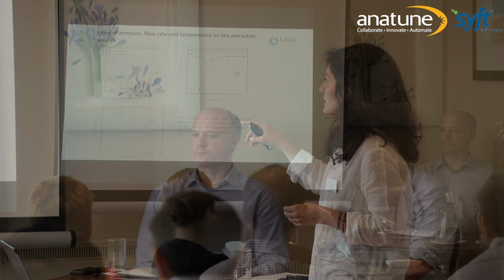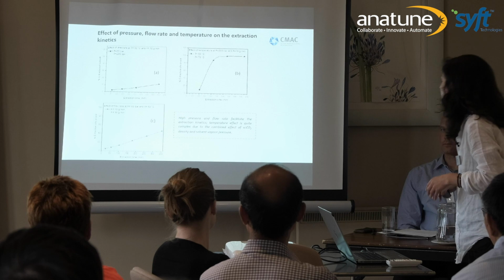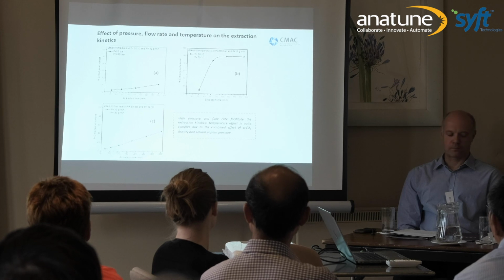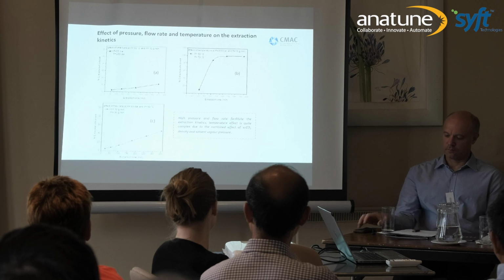As you can see at 180 minutes, or you cannot see because the numbers are really small, at 200 bar we managed to completely remove the solvent, while at 180 minutes, at 80 bar, we removed only 20%. So definitely we can see that high pressure facilitates the extraction kinetics, because high pressure means high density of the carbon dioxide, and more CO2 molecules interact with the dodecane.